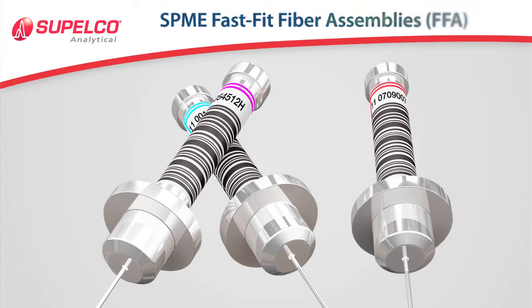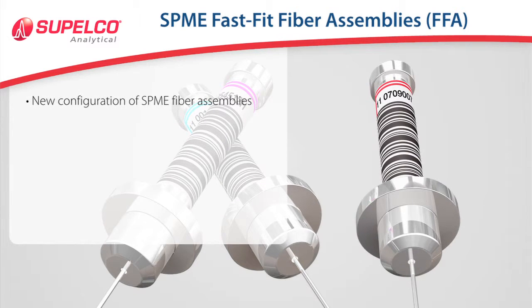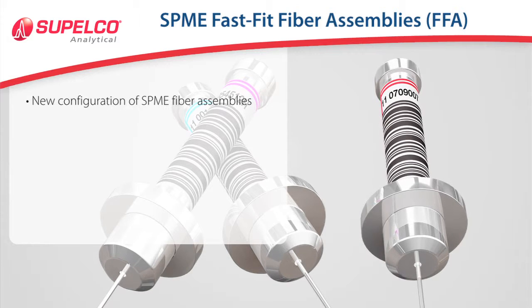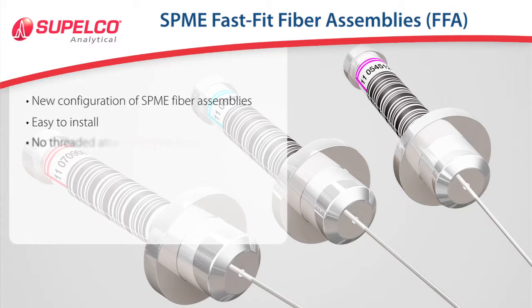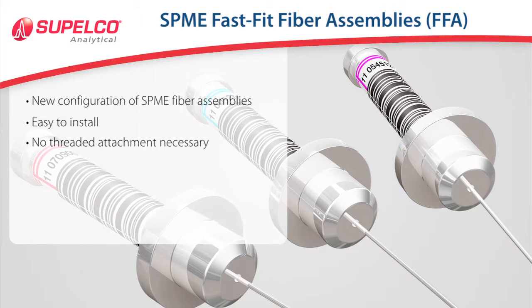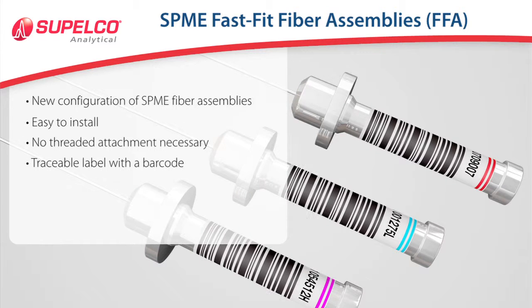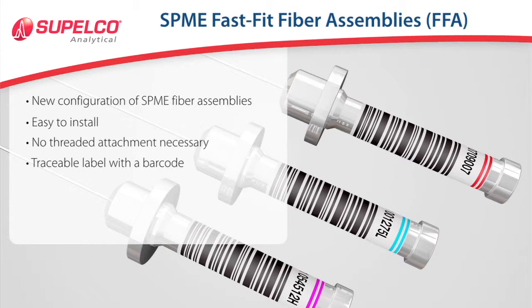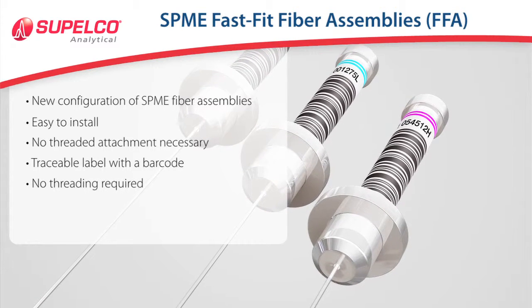The standard SPME fiber assemblies from Supelco are now complemented by a new configuration called the Fast Fit Fiber Assemblies, or FFA for short. These SPME fibers are easy to install, with no threaded attachment necessary for the fiber holder. In addition, the SPME Fast Fit Assemblies have a traceable label with a barcode. The advantage is there is no threaded hub as with the previous SPME fiber assemblies, so it doesn't require threading into the SPME fiber holder.